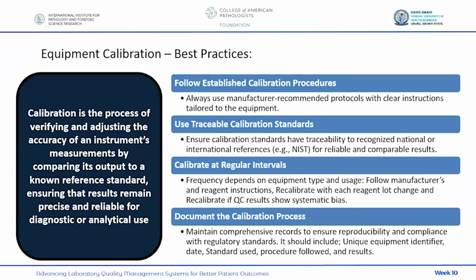Okay, so what about calibration? This is the process of verifying and adjusting the accuracy of an instrument's measurements by comparing its output to a known reference standard, ensuring that results remain precise and reliable for diagnostic or analytical use. This is calibration. A lot of us are familiar with equipment calibration.